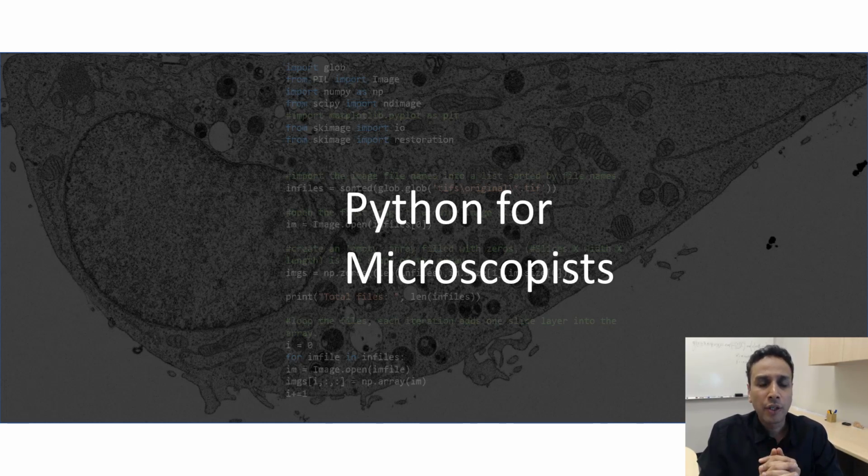In today's tutorial, we're gonna learn a little bit about histogram-based segmentation. This is where you take gray level ranges and then segment different regions that have different gray levels. Of course, this technique is going to work only if you can identify or distinguish different regions based on histogram only, based on gray level only.